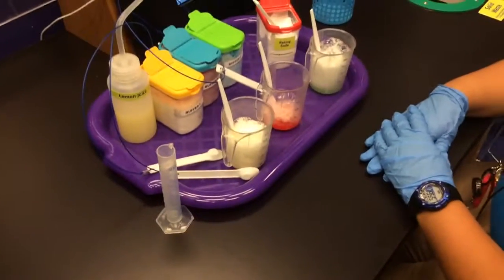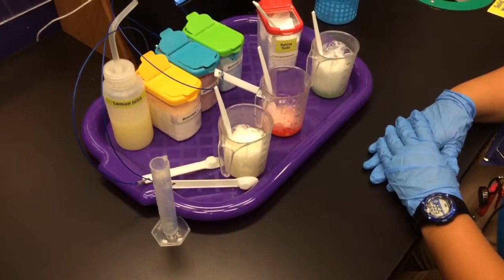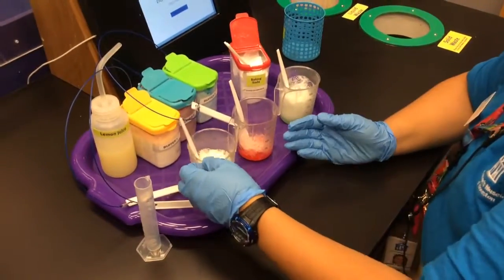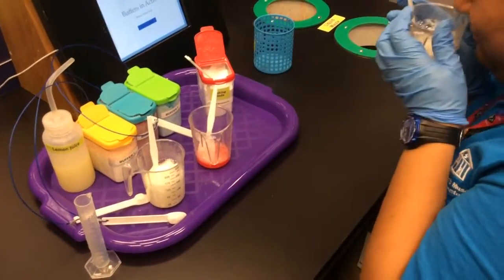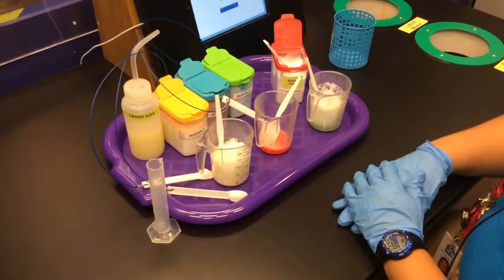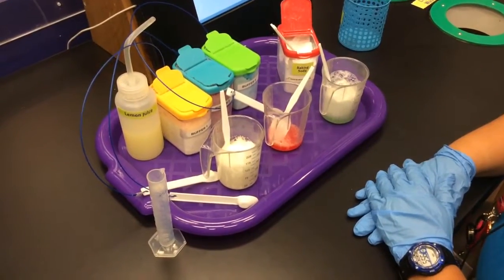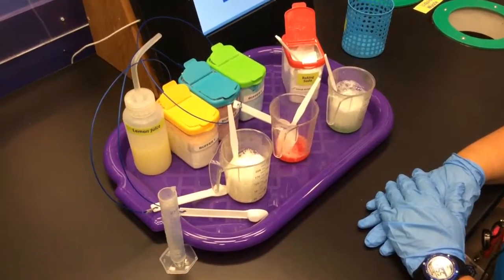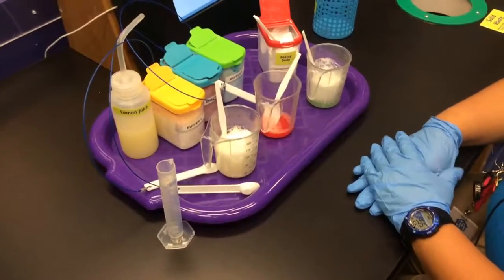Another thing we can do is we can actually smell each of the beakers. And so just go up to it and waft it a little bit, Selena. Okay, and so because of the different types of buffers that we use, there are other properties that they can give off, and one of those is a smell. It gives off an aroma because of the type of samples that we're using.